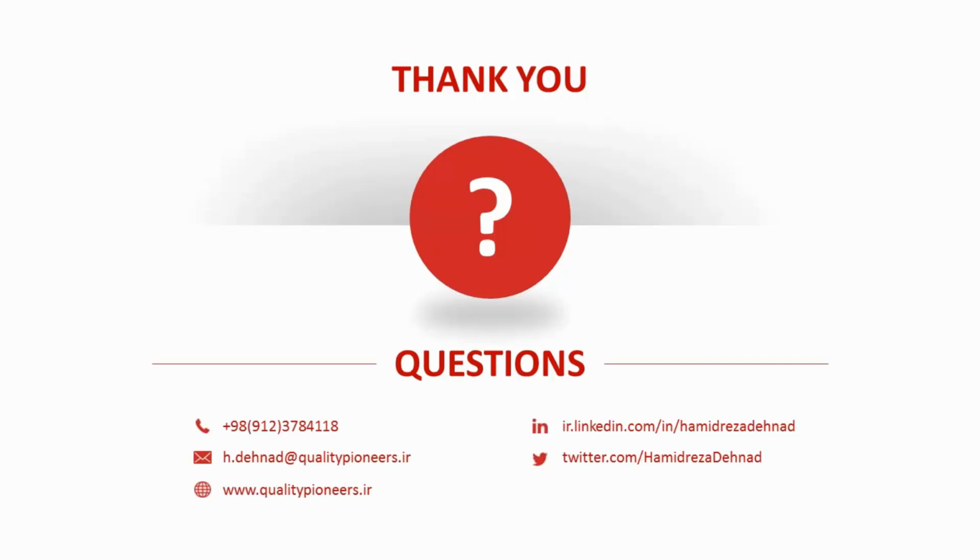Thank you. Another question is, should the method used to calibrate be included on the calibration certificate? Yes, according to ISO 17025, the calibration method should be stated on the calibration certificate.